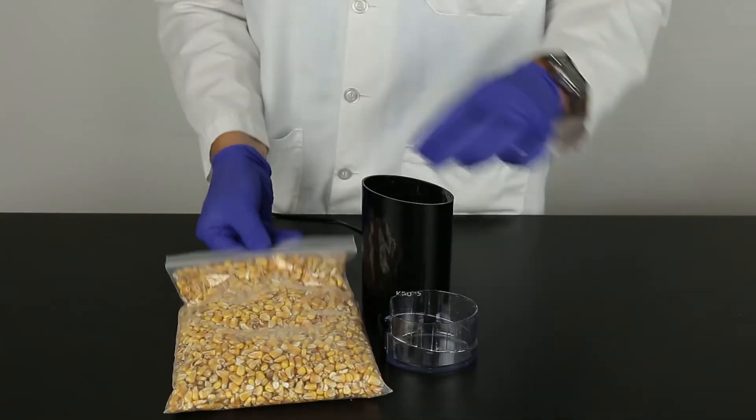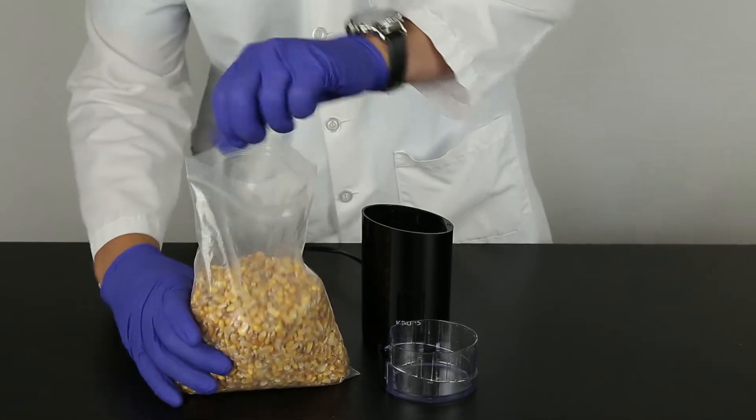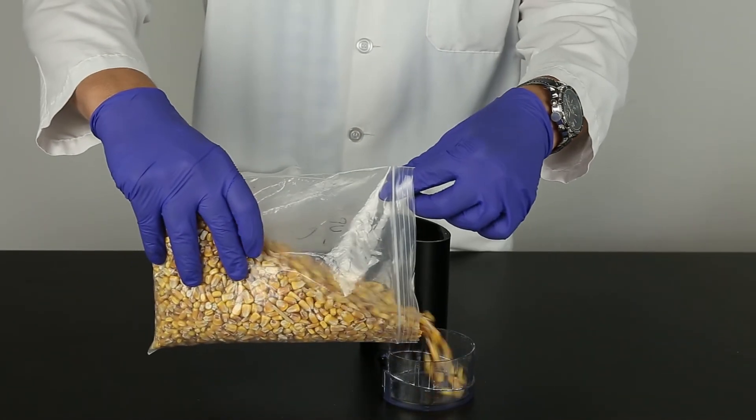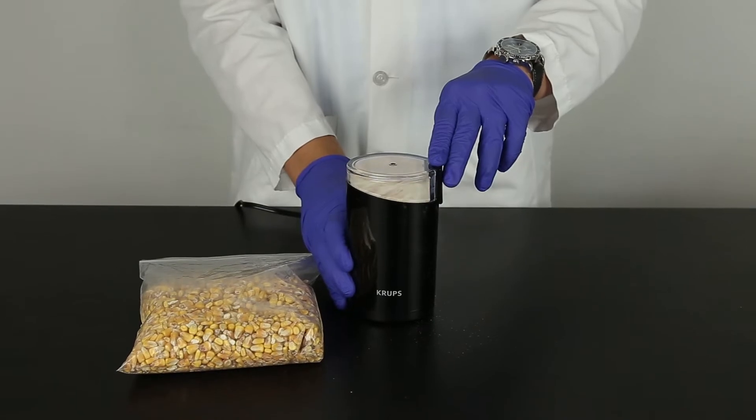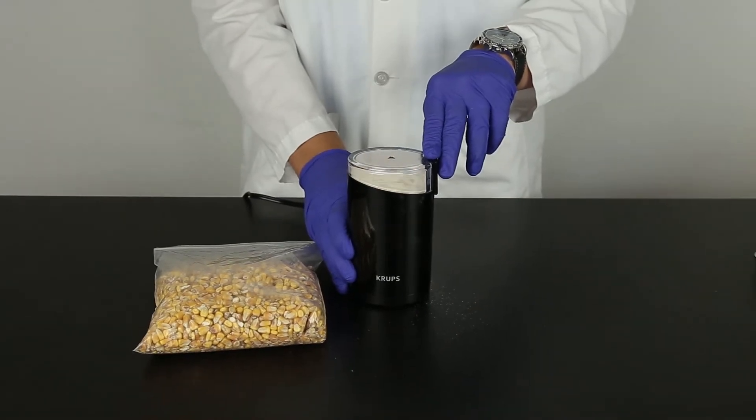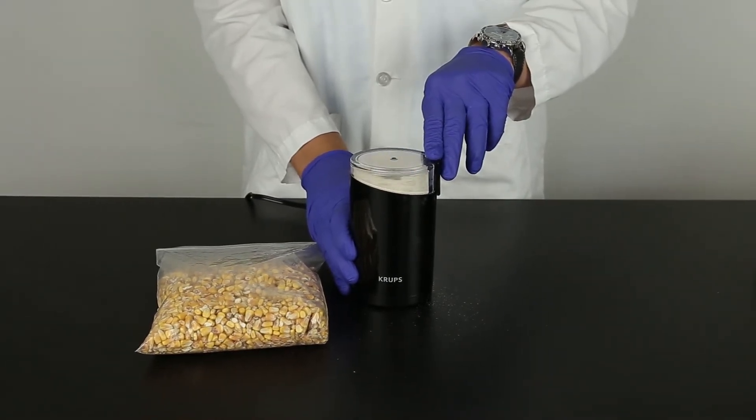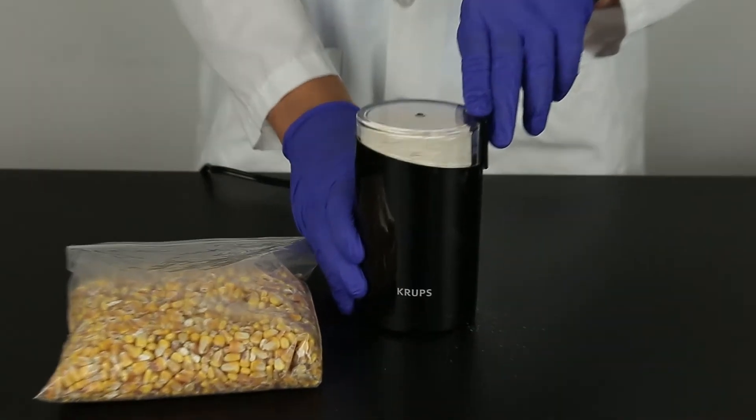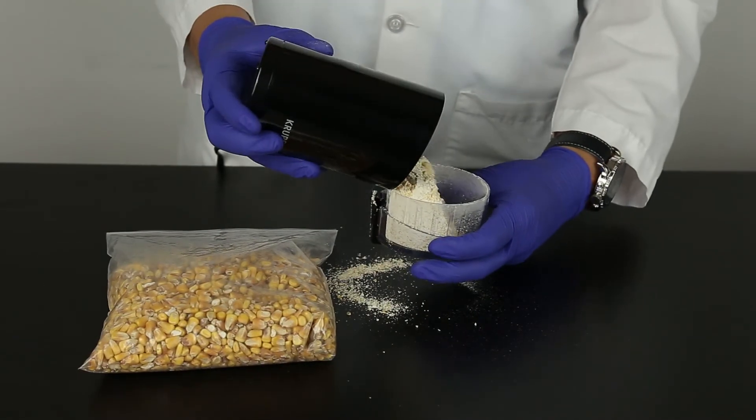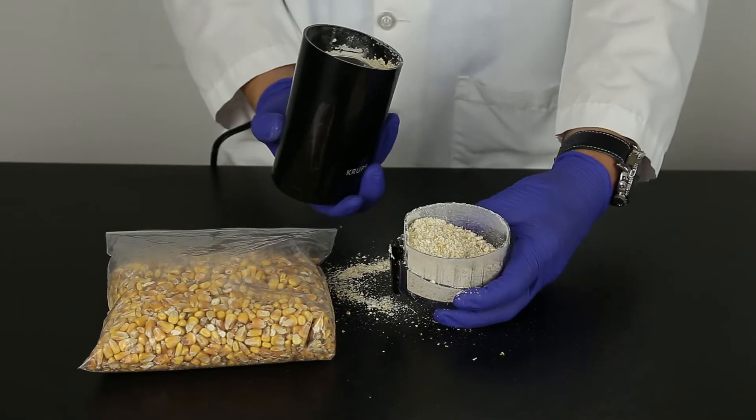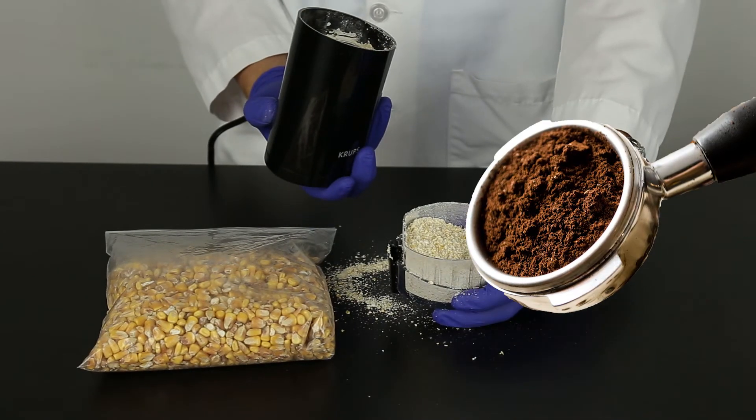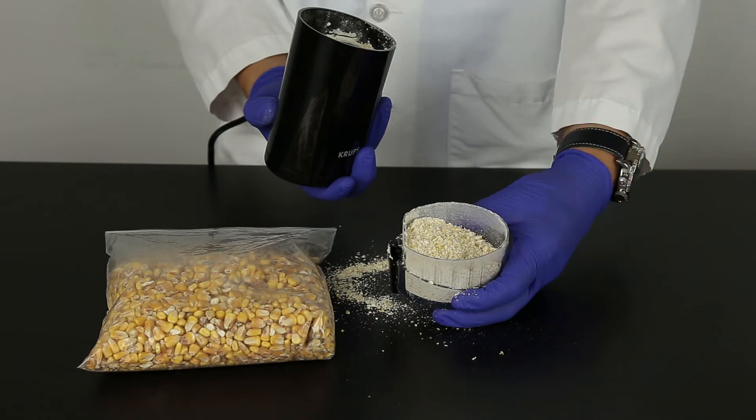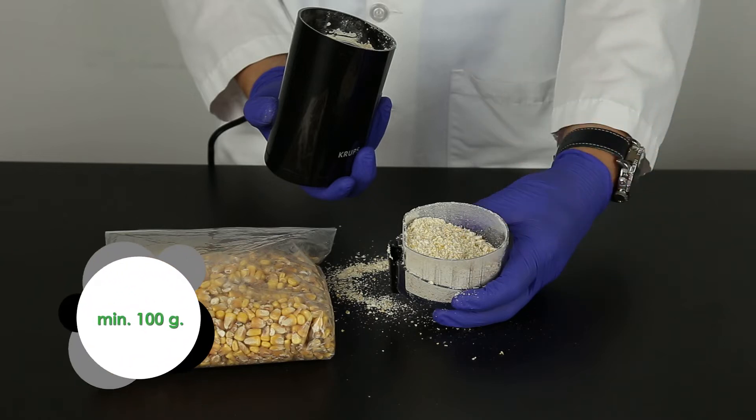The sample to be tested should be collected according to accepted sampling techniques. See the FGIS sampling protocol or contact your Neogen representative. Obtain a representative sample and grind so that at least 95% of the ground material passes through a 20 mesh sieve. The particle size should be about the same as espresso. It is best to grind a minimum of 100 grams of your sample.